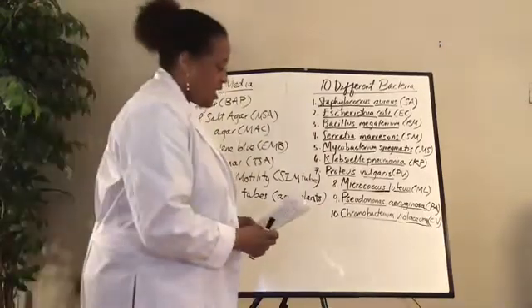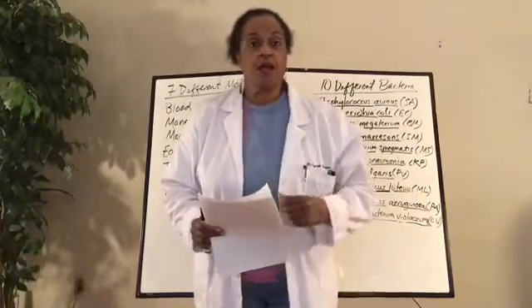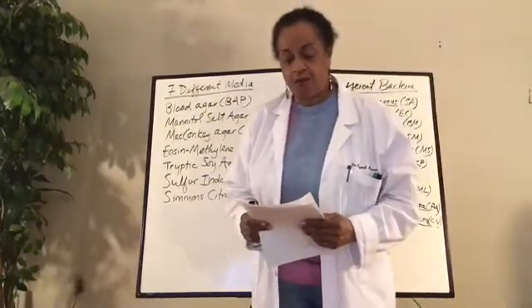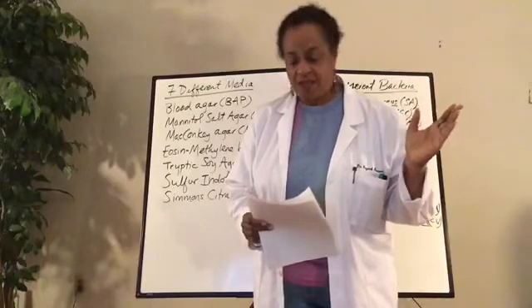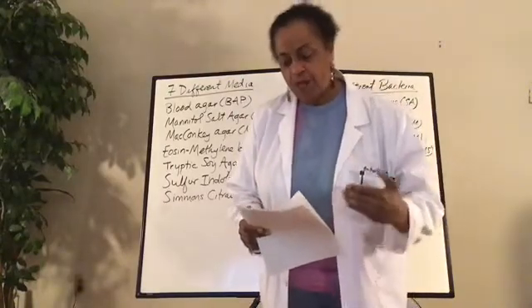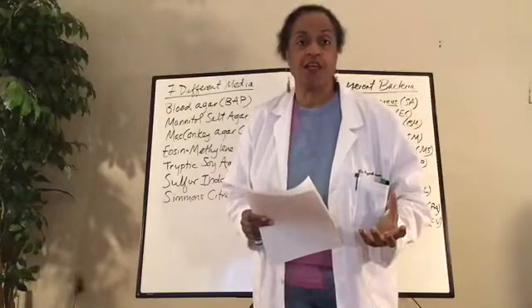All right? So let me just go over differential media and selective media, because that's what you need to know about. Differential media grows several types of microorganisms. It grows a lot of different microorganisms, a lot of bacteria. But the differential media is designed to bring out visible differences. So differential media, you will see the difference in all the bacteria that it can grow.